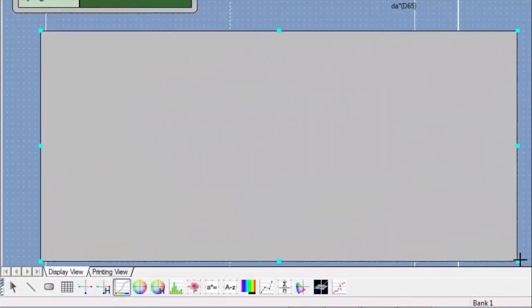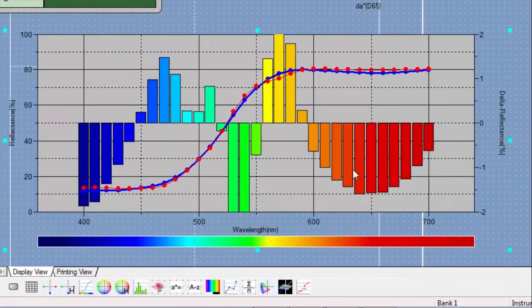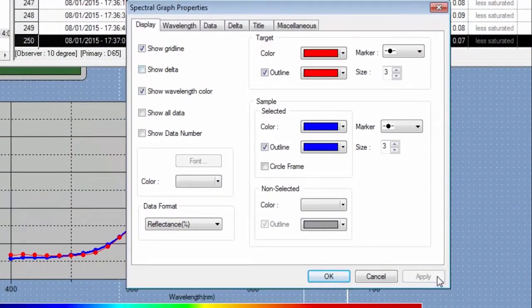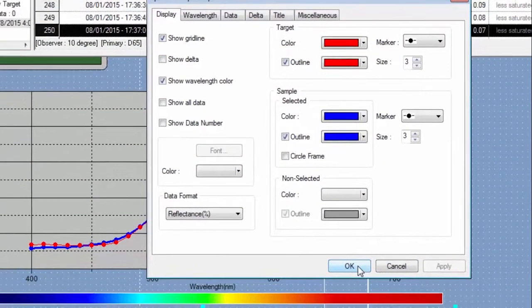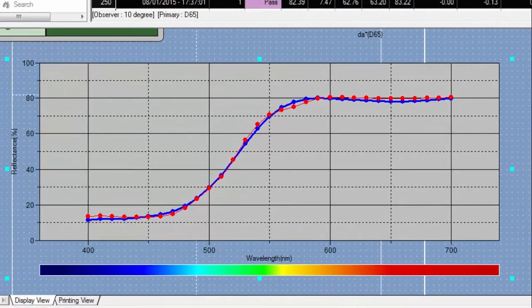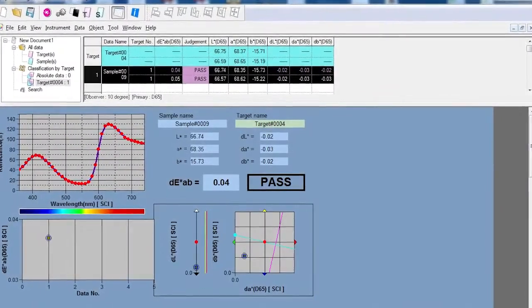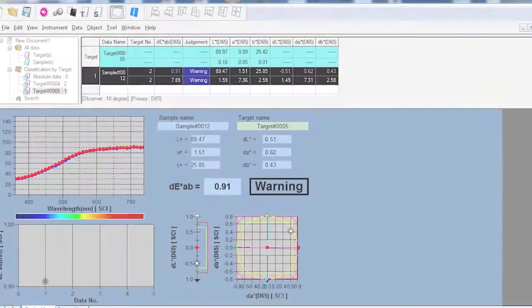Immediately begin analysis with predefined templates or customize your own. Design screen and print layouts that meet your quality control needs. Reports vary by application from simple pass-fail assessments to trend charts, histograms, color plots and spectral graphs.